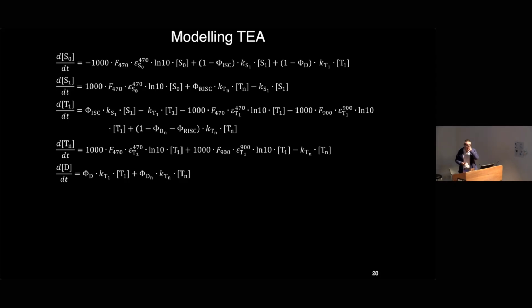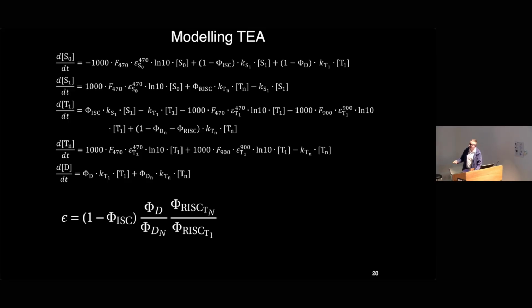This is the set of differential equations that's governing the transition between the different energy levels. And I'm fairly good at maths, but I can't solve that. So I have to put it into a computer and do some numerical simulations instead. But if you set aside 2 weeks of time, lots of cups of tea, and stare at these equations, eventually you'll come up with this equation which tells you this enhancement factor. So this epsilon here is telling you how much better your photobleaching rate is. So if this number is less than 1, you've made things worse, things bleach faster. If this number is greater than 1, congratulations, you've now made your fluorophore last longer, effectively for free.